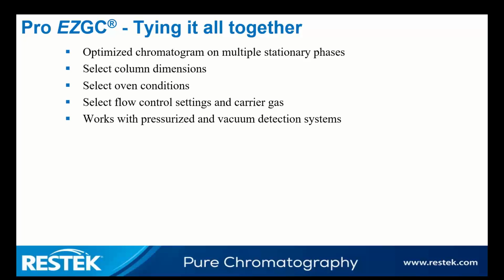We had some people that were doing Freon and Freon breakdown research. So it was how Freons react under UV light atmospheric conditions. And they had modeled 120 meter RTX 200 by 0.25 millimeter ID by 1.0 film thickness. And they were modeling that.